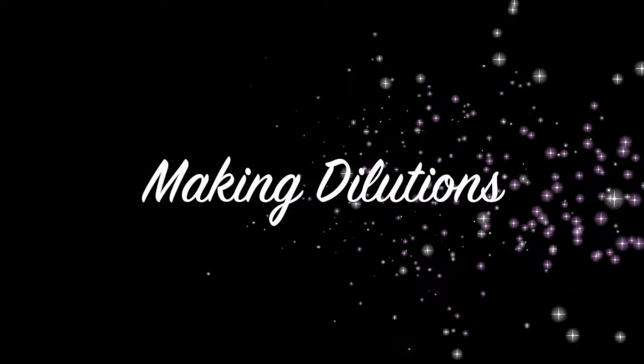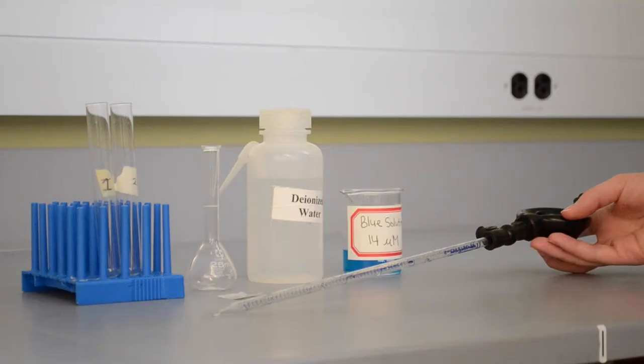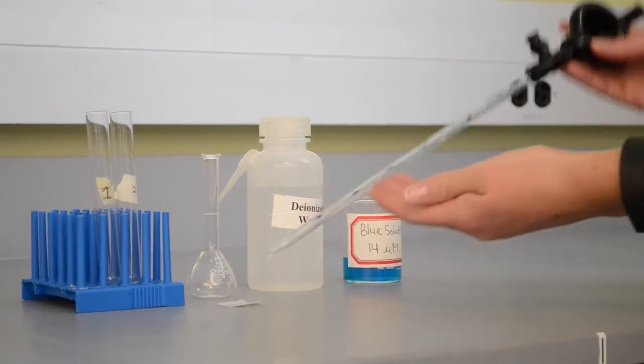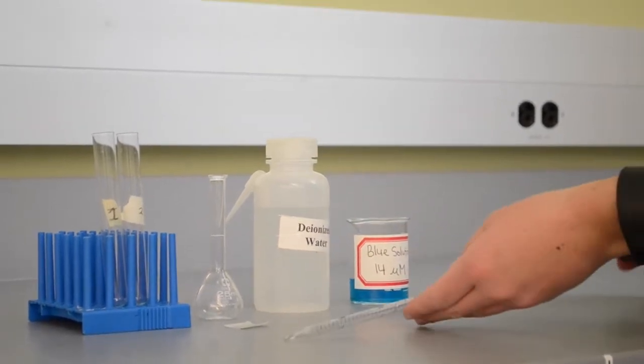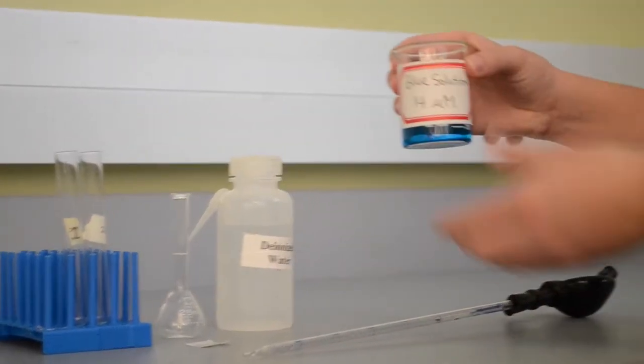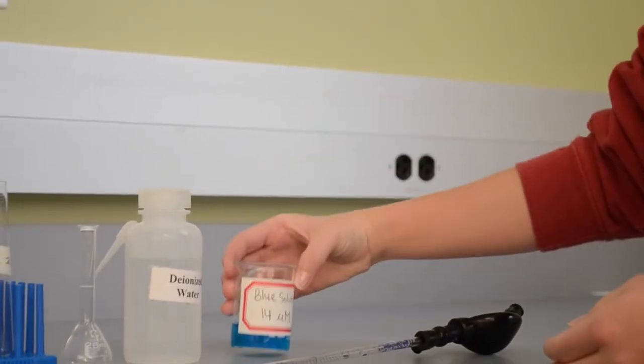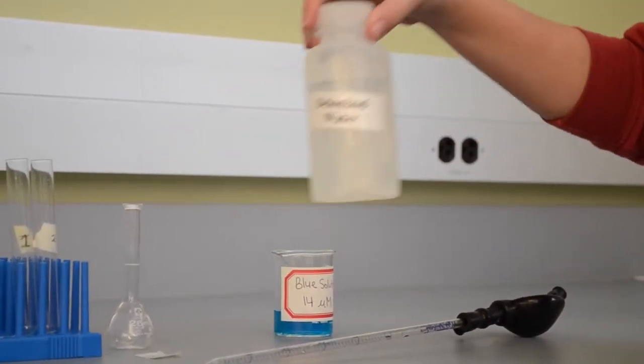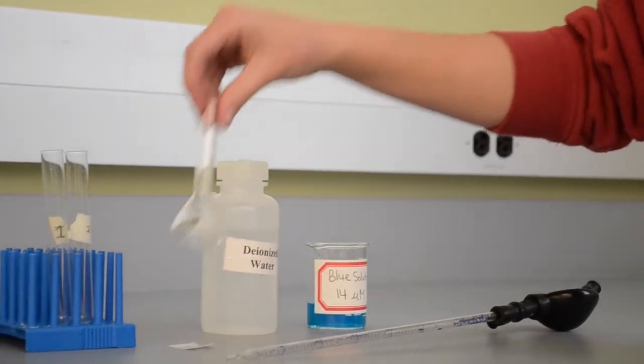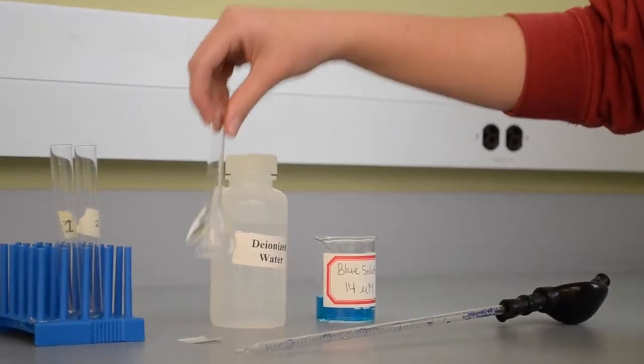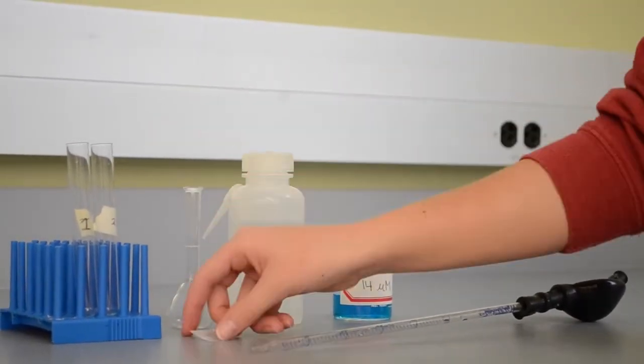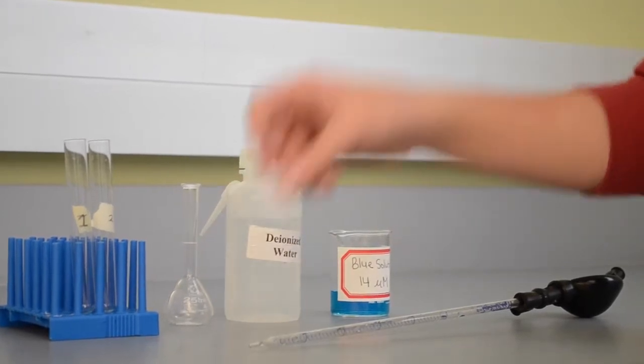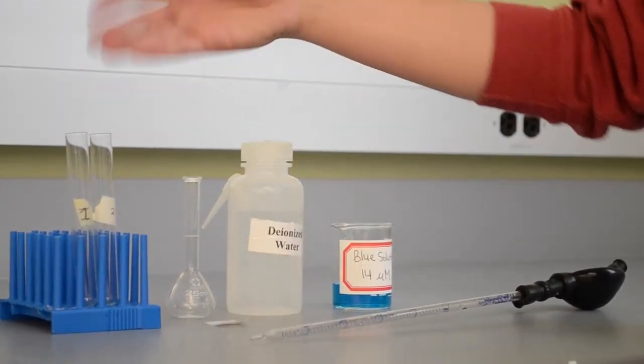Today we will be making dilutions. First you'll need a volumetric pipette, the solution you are wanting to make a dilution of, deionized water, a 25 ml volumetric flask, parafilm, and test tubes to hold your dilutions.